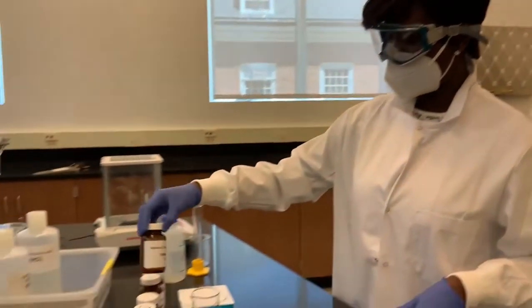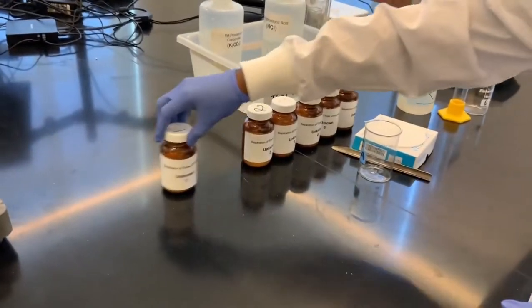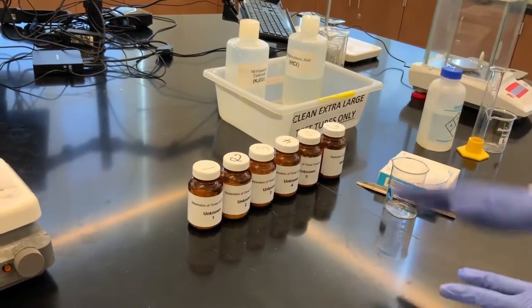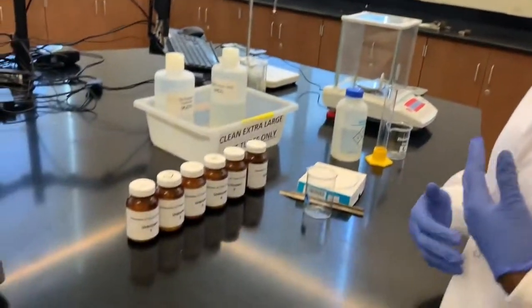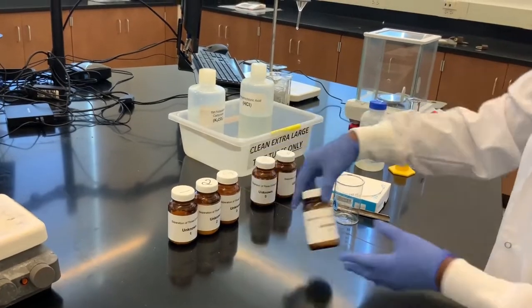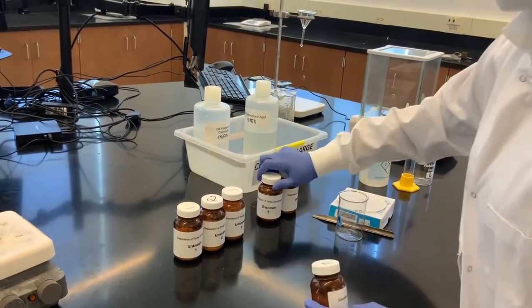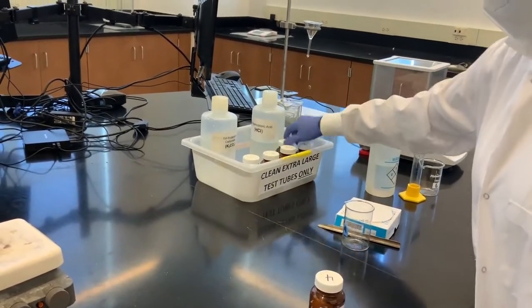So in the lab, you've been given 6 different unknowns. Unknown 1, 2, 3, 4, 5, 6. Actually, in the lab, you'll be working with only one. You can choose any one, or sometimes your TA will assign you which one you need to use. In this demo, I'm going to use just unknown 4. I just chose it randomly. So let's put the rest of the unknowns in our secondary container.